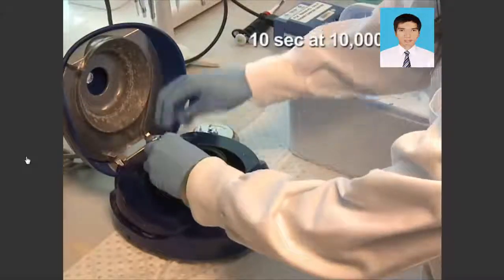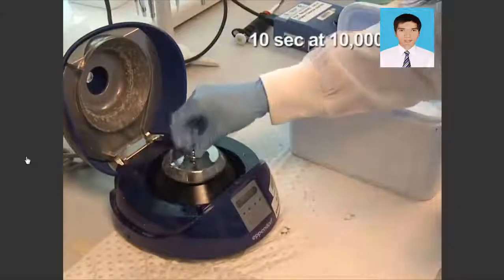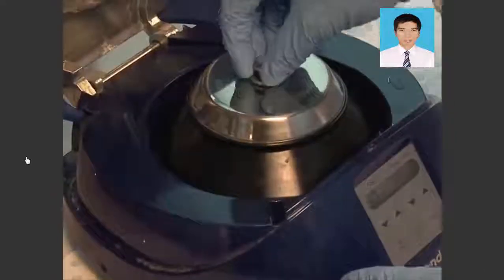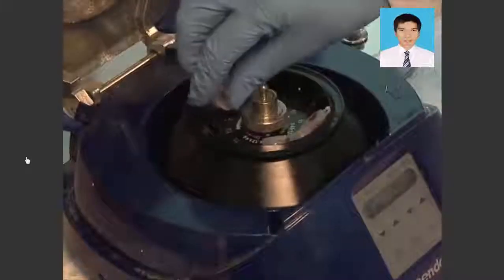Centrifuge the tubes for 10 seconds at 10,000 G's to ensure the DNA is at the bottom of the tube. The denatured DNA samples are now ready for bisulfite deamination, which will be demonstrated next.